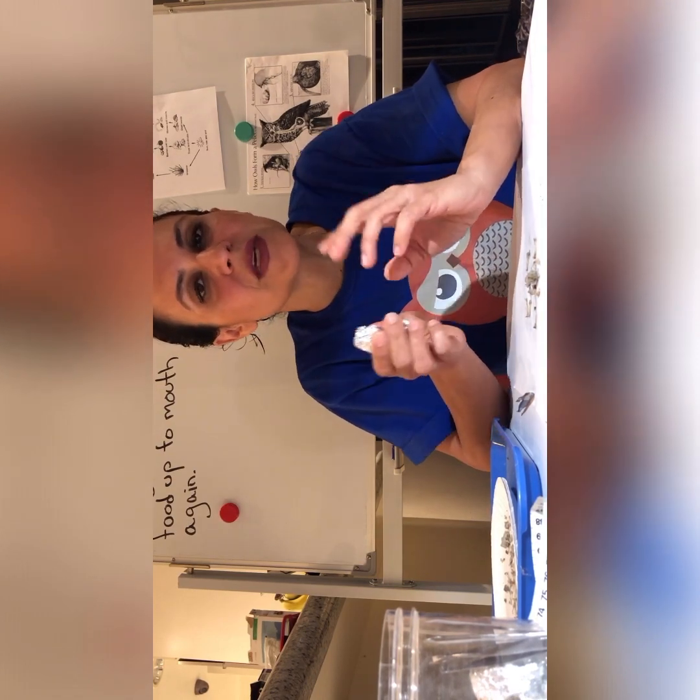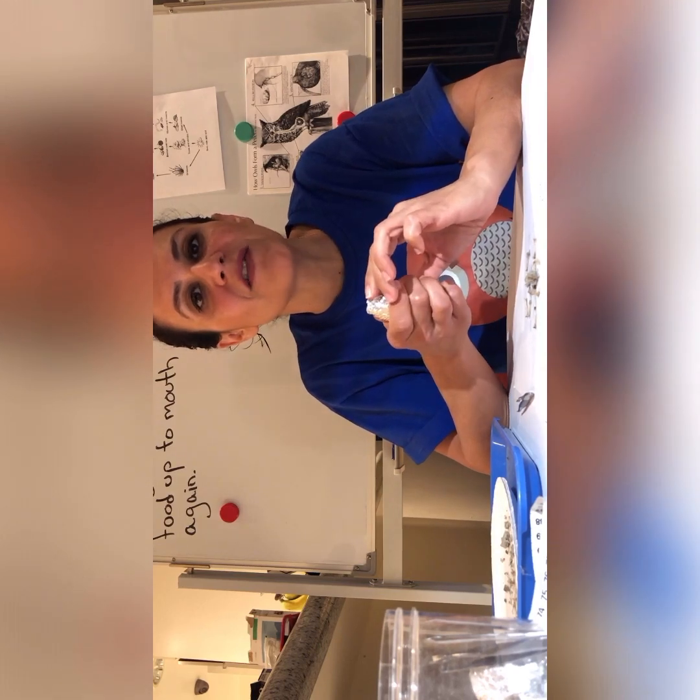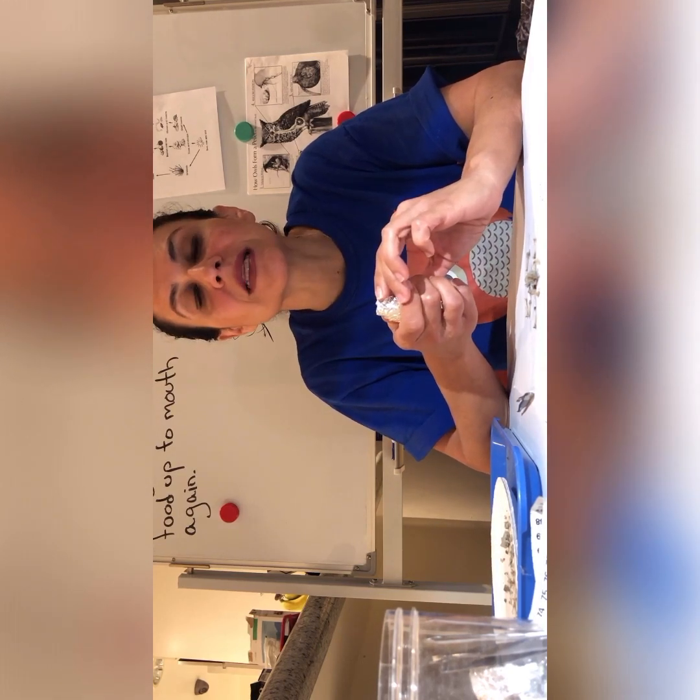The reason we do this, the reason we dissect, is because it helps us trace back and find out what do owls like to eat.